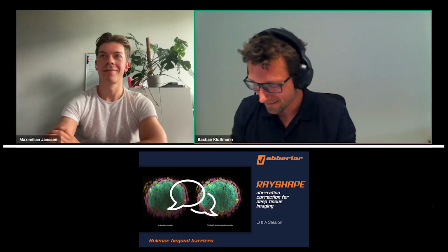But for most users, the Inspector software is far too overwhelming, because in most cases there are biologists sitting in front of the systems, and even though I'm a biologist myself, Inspector can be a little bit overwhelming, and you have to know what you're doing. But if you have one of our systems, you can get a special training for that and also use that one if you like. Okay, I hope that answers the question.